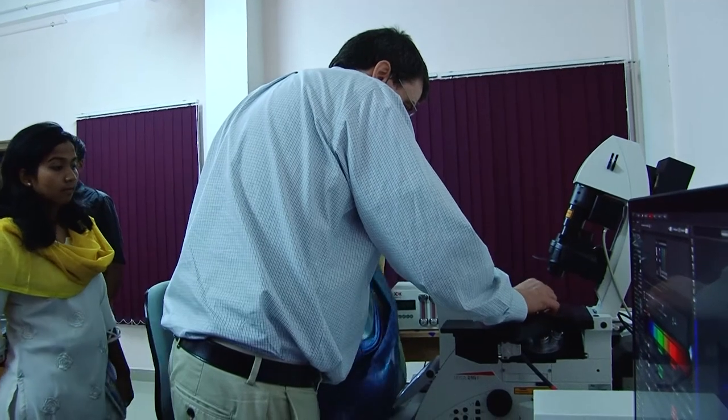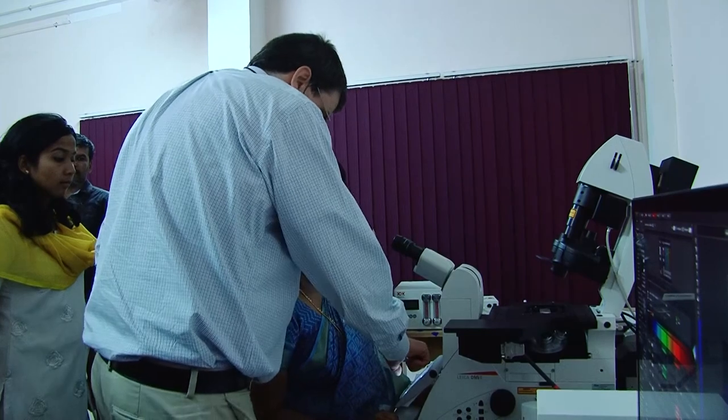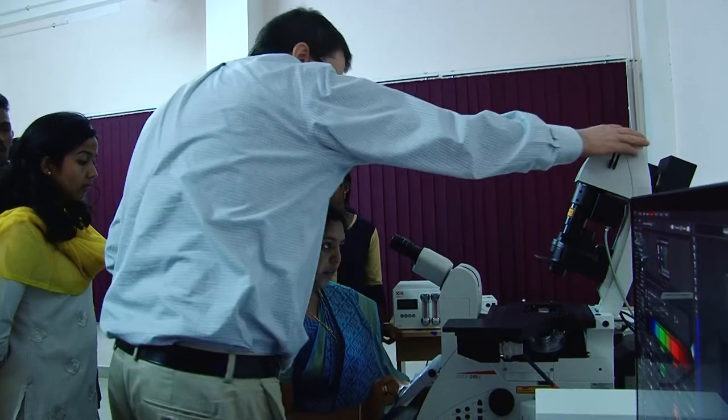Okay, so the stuff's going to be in this circle here, okay? So you're going to hit bright field, BF. And the shutter, I think, go ahead, push it. I'm not sure if it's on or not.